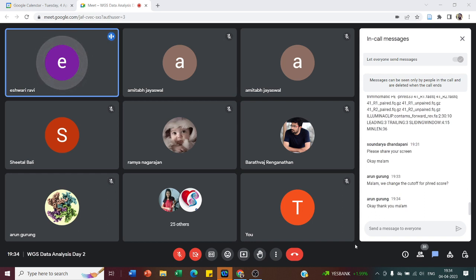Based on the samples we have downloaded today, I will share the logs for installation of the tools and how we use the tools going forward. I would want you all to do one assignment: download or install either Bowtie 2 or BWA-MEM for alignment.